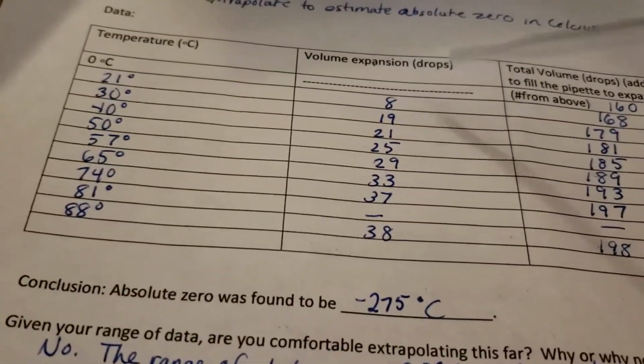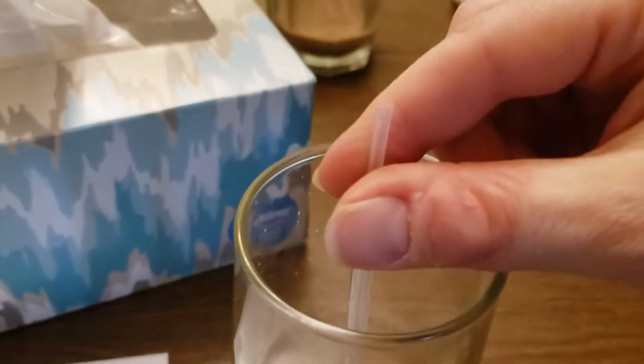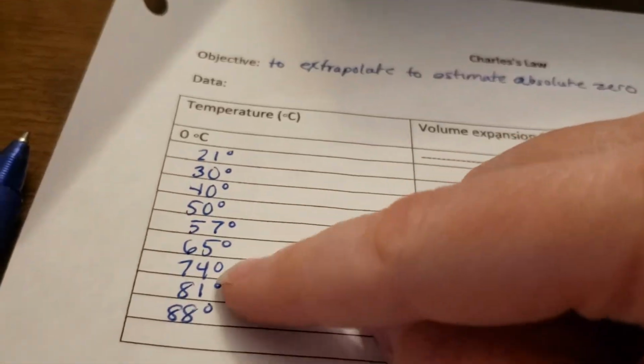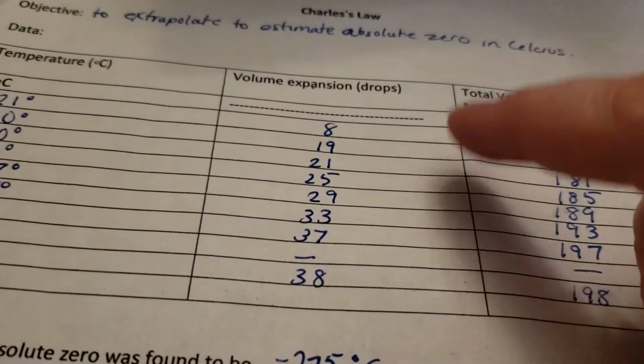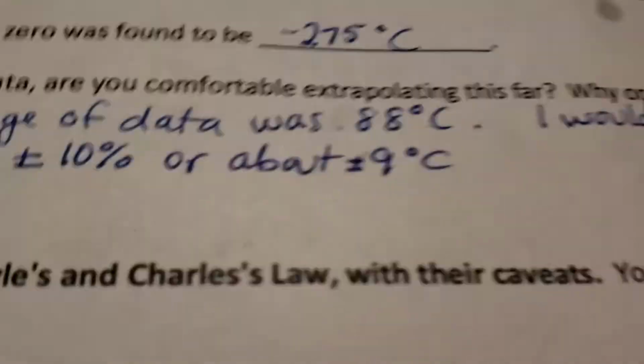So basically what happened is the warmer the liquid that was surrounding the pipette when it was empty and able to allow gas to expand, right? As we got hotter and hotter, then more and more drops, once I grabbed it and moved it under the ice water, I would suck up more and more of that cold water because the gas had expanded and then contracted.